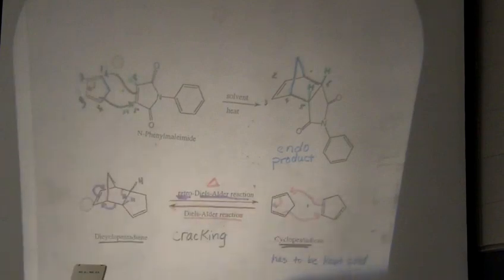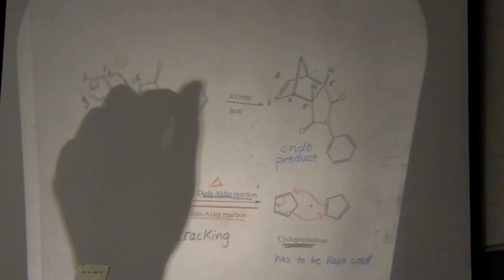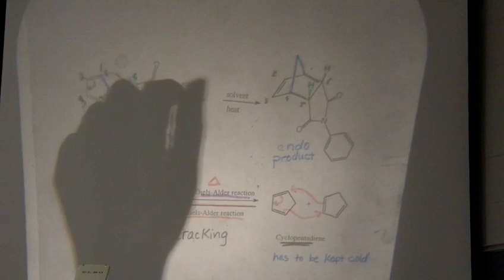And you'll find that this week, your reaction will go lickety-split. You will actually visually be able to see it go, because this is bright yellow, and so you'll have a yellow solution, and then all of a sudden it won't be yellow anymore, and that's how quickly it'll react, okay?